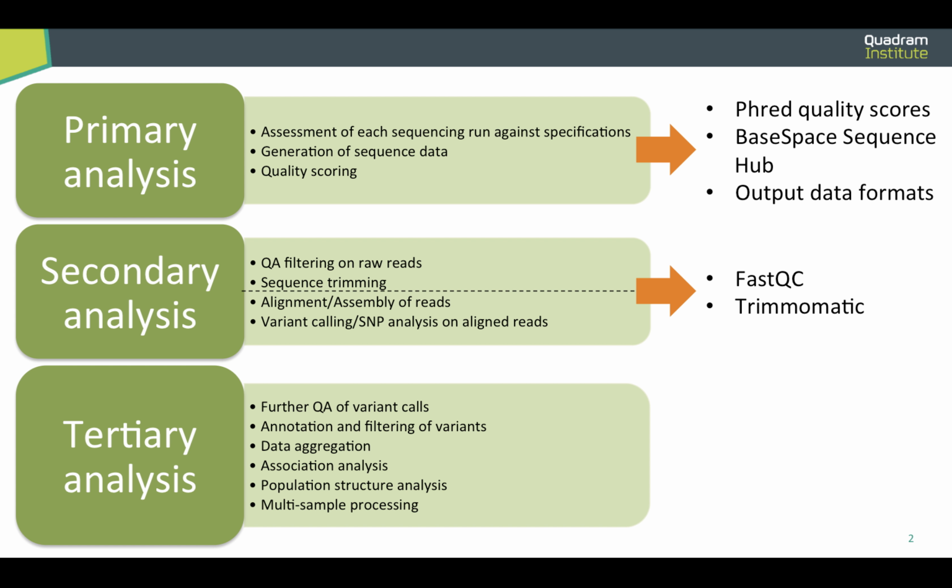Tertiary analysis, I'm definitely not going to talk about that because that's a lot further down the line, but that's more your aggregating all the data from lots of different samples together, comparing those, perhaps identifying an entire population and comparing different populations with each other, or the really big scale analysis that links the sequence data into what's the biologically relevant outcome, and really answering the question that you wanted to answer in the first place.